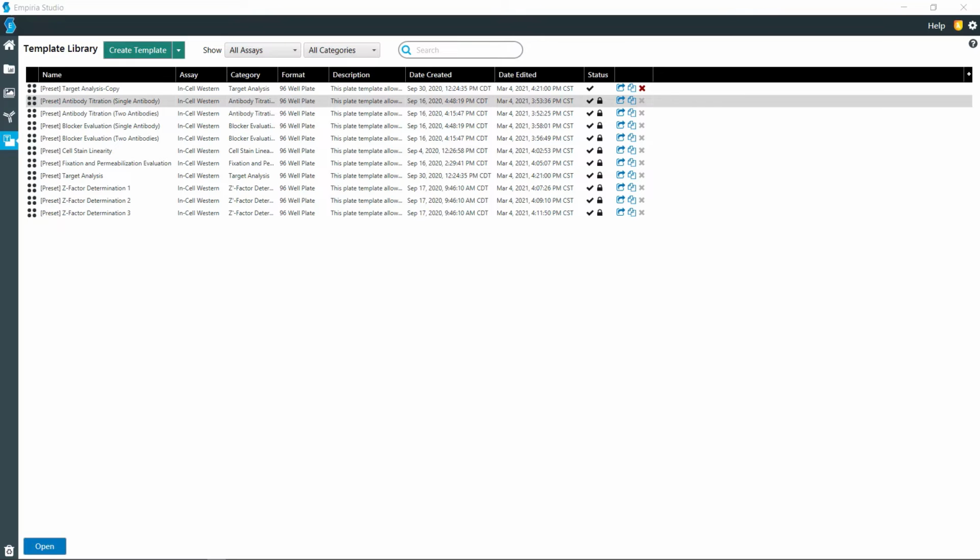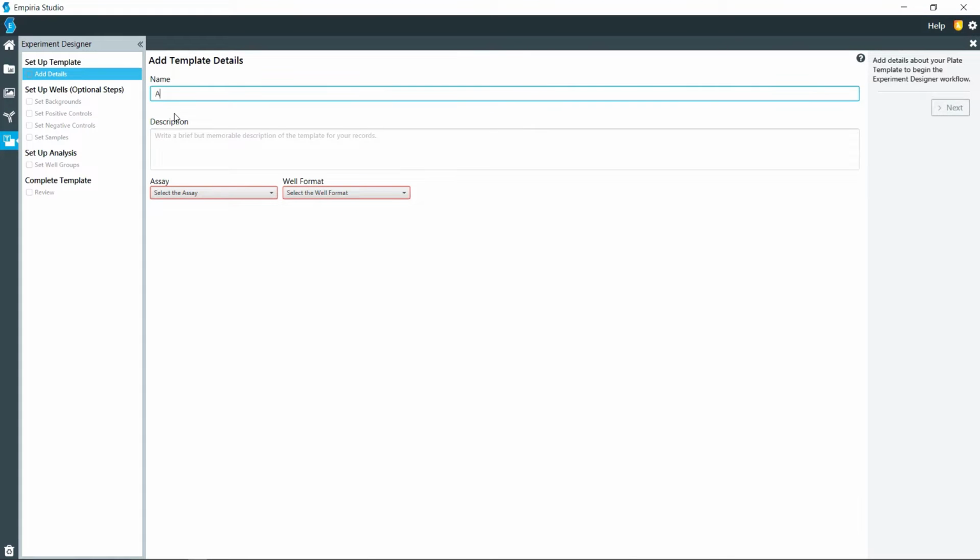In this video, we will be going through the steps involved with creating a template for antibody titration for the In-Cell Western, ELISA, and cell analysis. So here in the template library, go ahead and click on Create Template and give it a name.